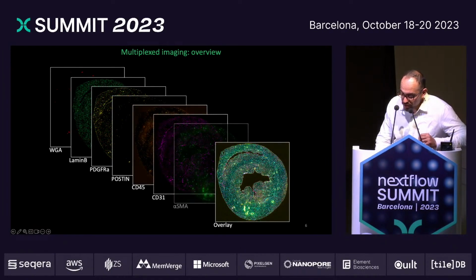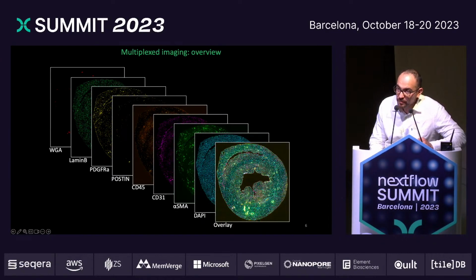Multiplex imaging is a family of methods that allow the cyclic staining of samples. One can have multiple cycles in a single run, and within each cycle have 3 or 4 markers. So at the end, one ends up with 20, 40, or even hundreds of markers in the same sample. Just as a personal anecdote, I was in the field of microscopy 5 years ago, and back then people were happy with 4 or 6 markers. So the progress of multiplex imaging is just tremendous.